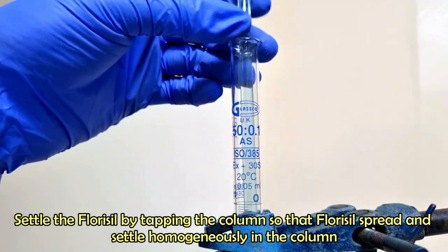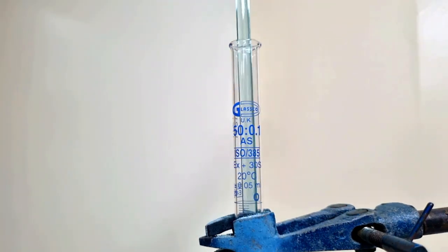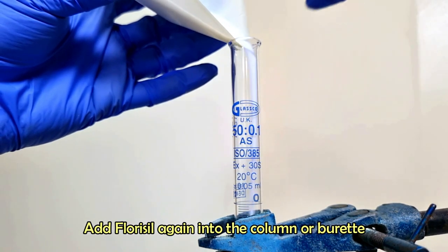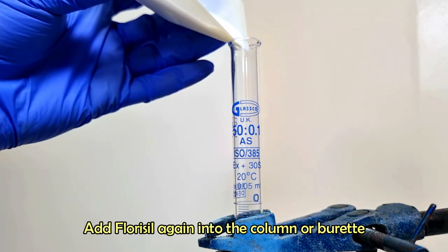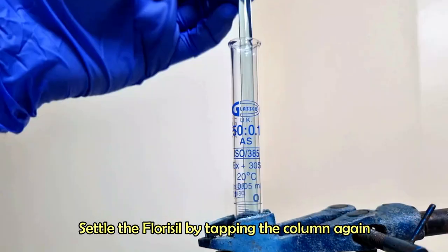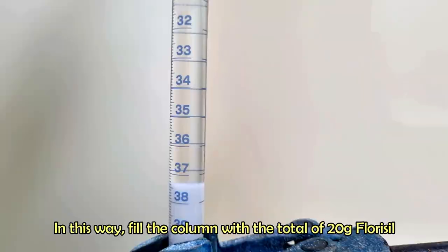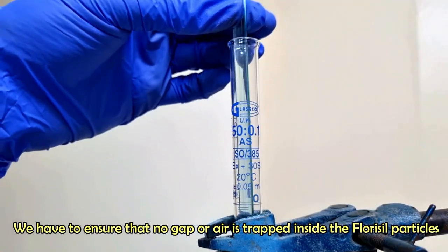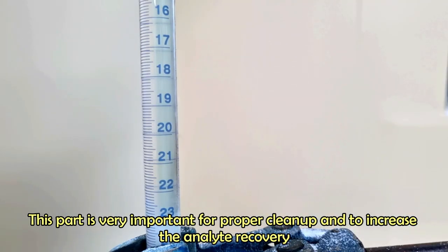Settle the florisil by tapping the column so that florisil spreads and settles homogeneously in the column. Add florisil again into the column or burette and settle it by tapping the column again. In this way, fill the column with 20 grams of florisil. We have to ensure that no gap or air is trapped inside the florisil particles. This part is very important for proper cleanup and to increase the analyte recovery.